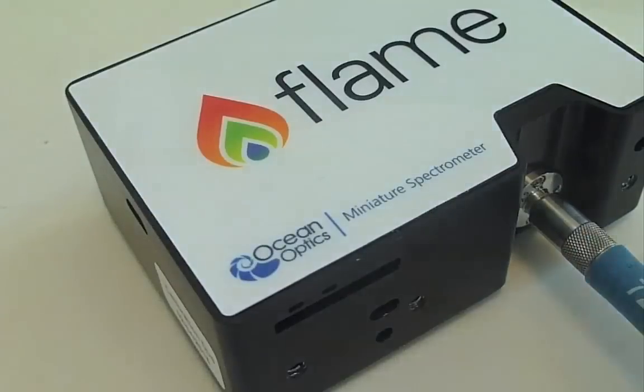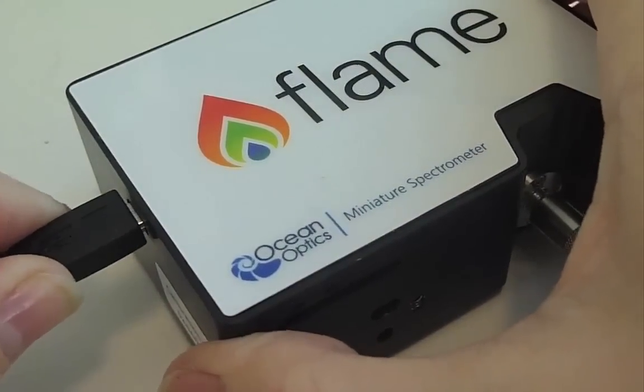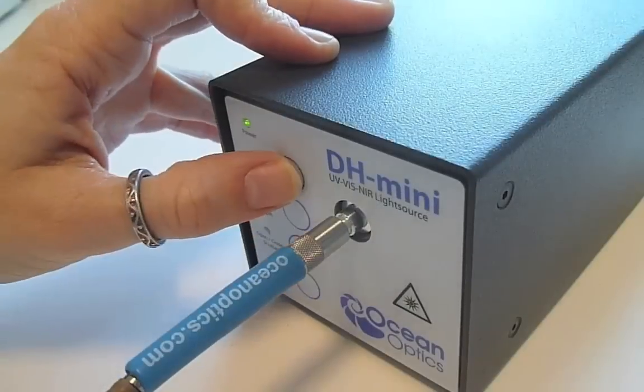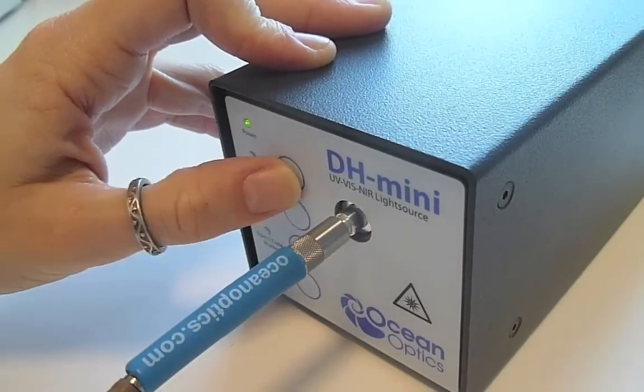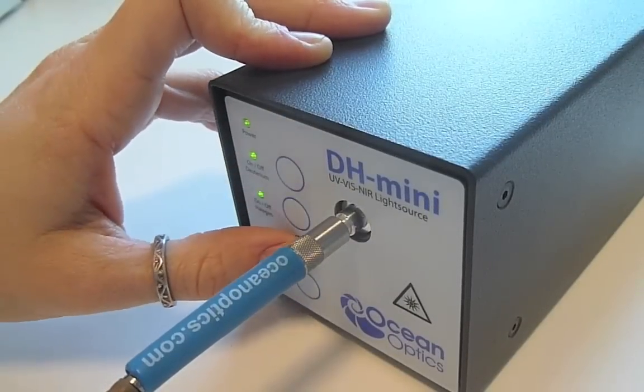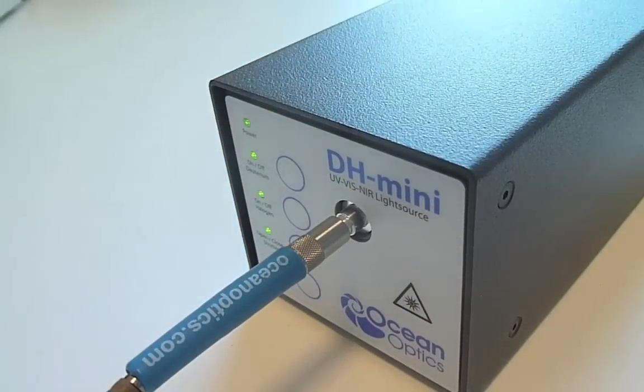Finally, make sure that your spectrometer is plugged into your computer with the micro-USB cable and switch on your light source. The DH-mini features a shutter, make sure this is open before taking measurements.